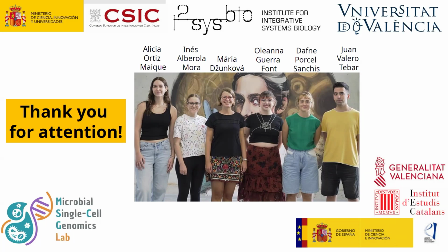And then at the end, when you do barcoding and you have everything lysed and so on, as Žana said, you can also use some special lysis buffer, which ignores your host cells and preferentially lyses your bacterial cells. But if this is not 100% efficient, you can still use some other kit that is targeting your host DNA. There are some probes, for example streptavidin beads, and you can either prepare them yourself. You can prepare some probes that will hybridize with the DNA of the host, and then you can collect everything that will be discarded, and you will just sequence the reads which are barcoded and belong to your bacteria. So I think there are several steps where you can do this.